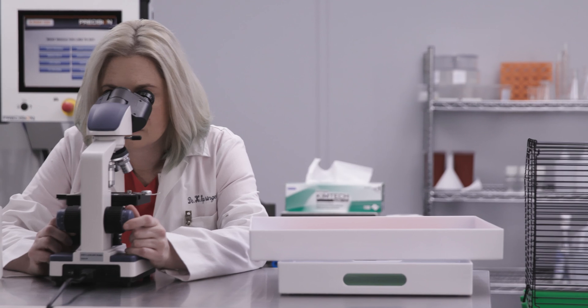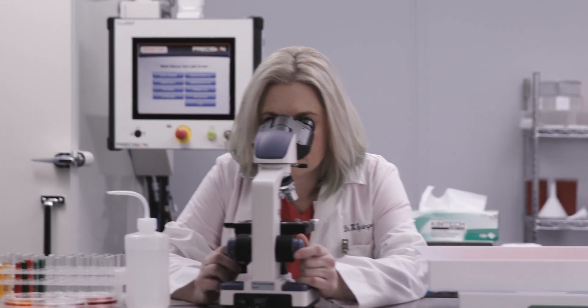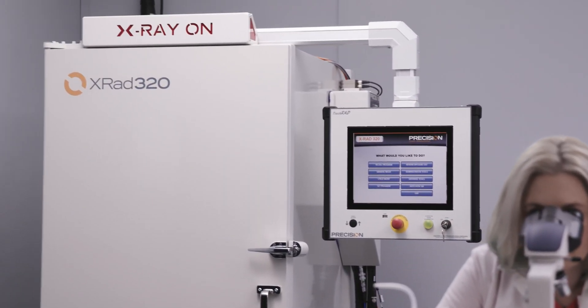Accomplish more with your research. Let Precision show you how an X-RAD irradiator provides the biological results you are looking to achieve. The X-RAD family, a workhorse in the irradiation industry.